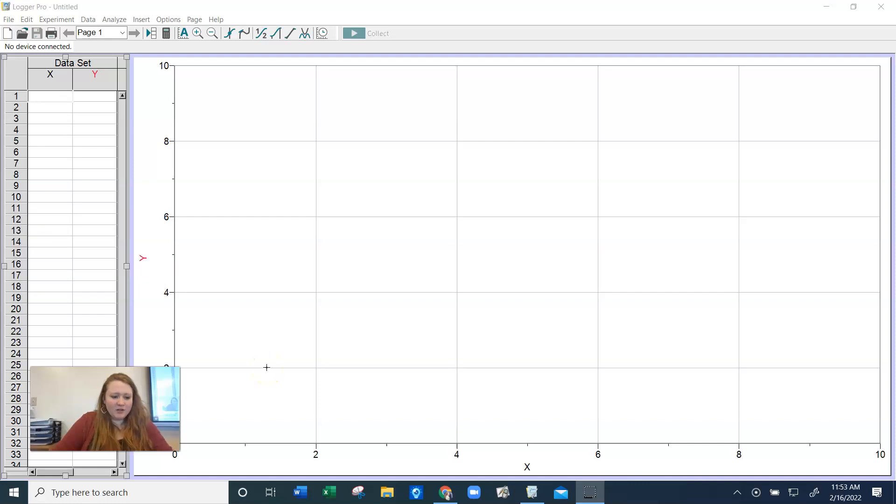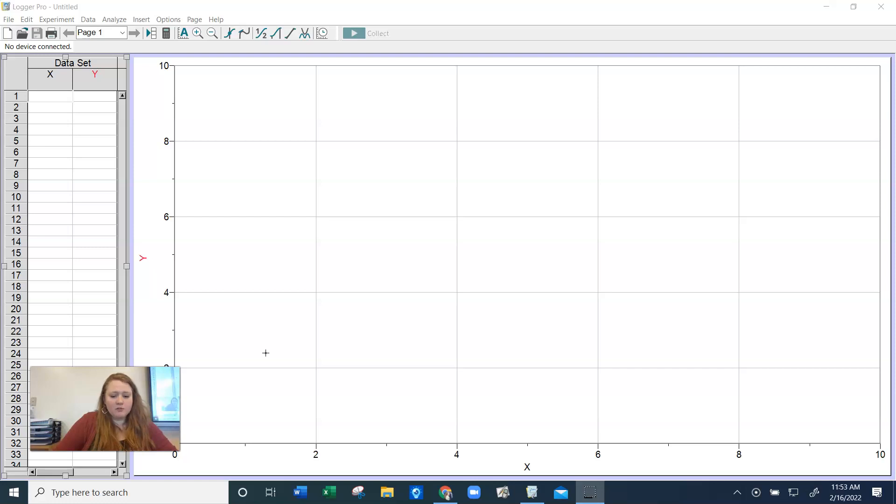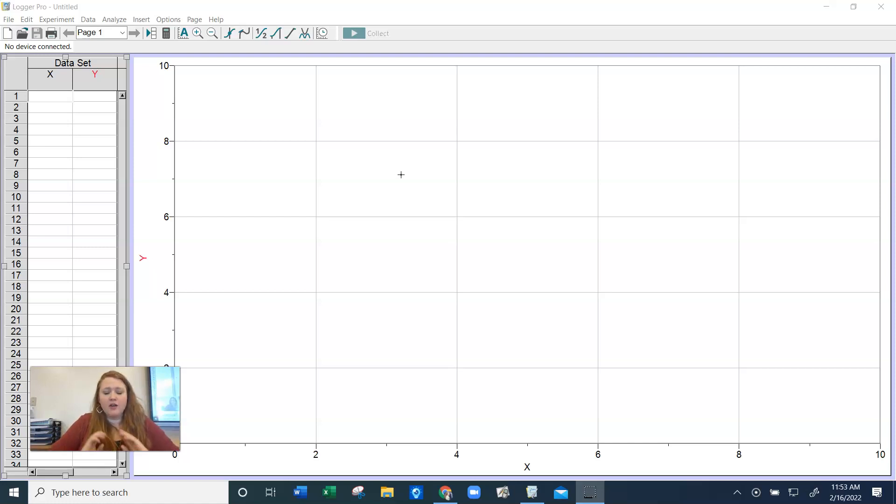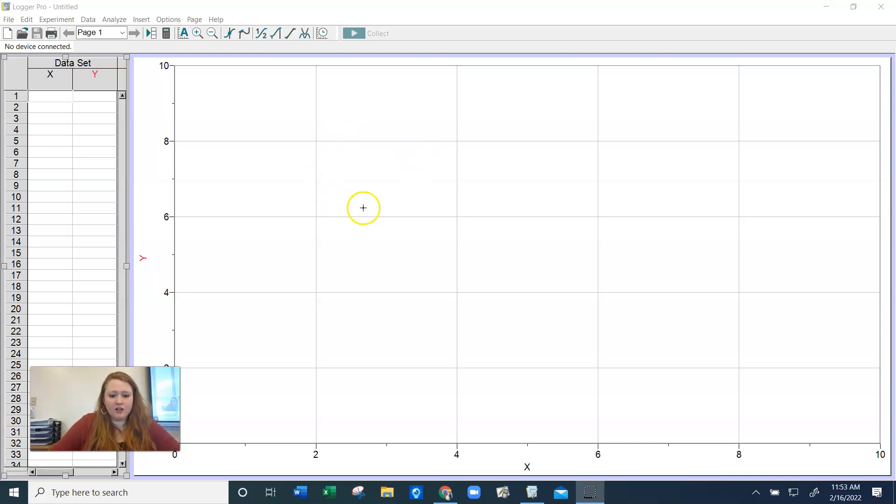Hey guys, it's Ms. Miller. I just wanted to quickly show you how to use Logger Pro on your laptops. We're going to be graphing our mass and volume lab today, and you're going to be putting two lines on your graph. So make sure you watch these instructions and follow along so that you can get a graph.